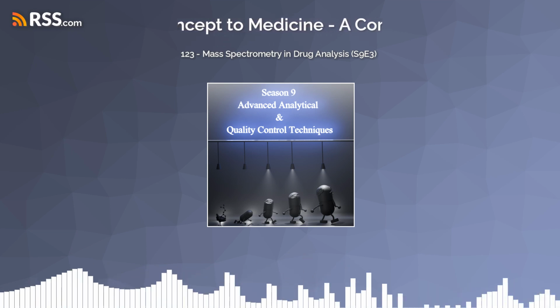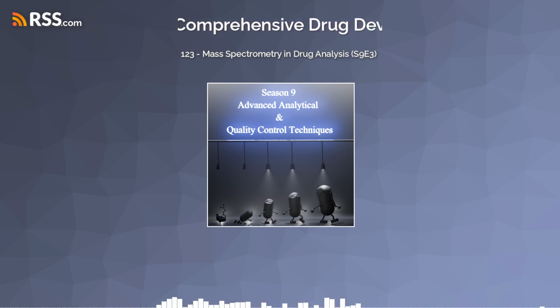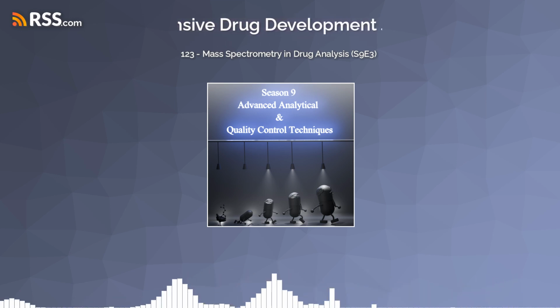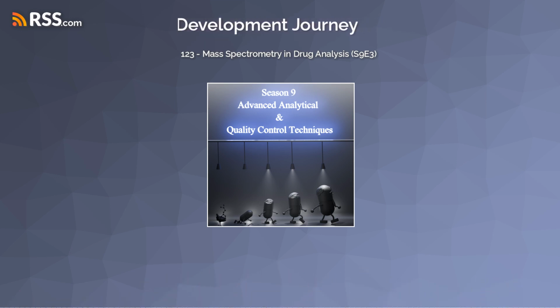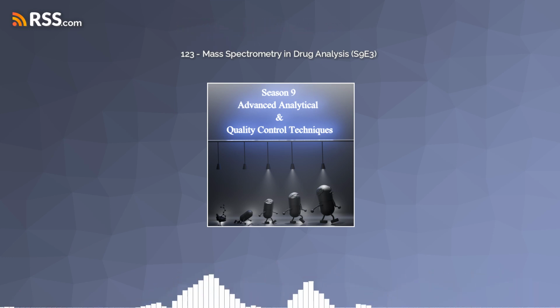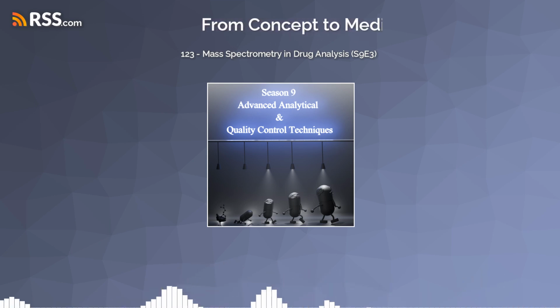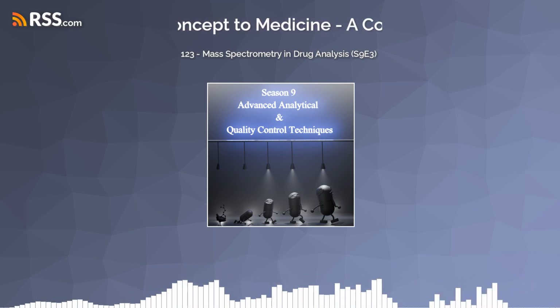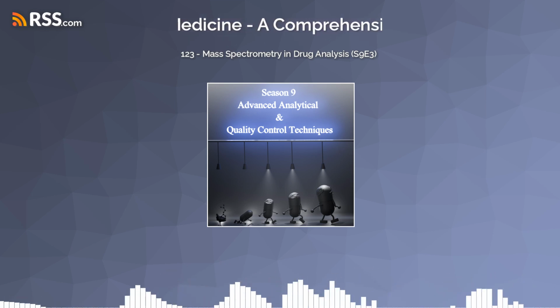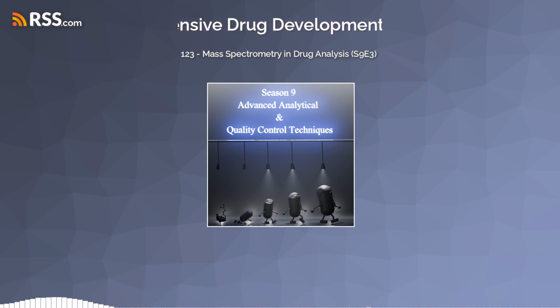What's another example of mass spectrometry in action? Think about the early stages of drug discovery. Scientists are making all these new potential drug candidates in the lab, and after every step, mass spectrometry acts as a quality control checkpoint. They use it to confirm that they've made what they intended to make and that there aren't any unwanted byproducts or impurities. So it helps them make sure they're on the right track and not wasting time on something that's not pure.